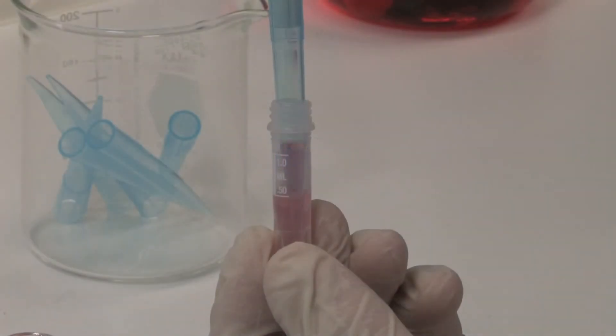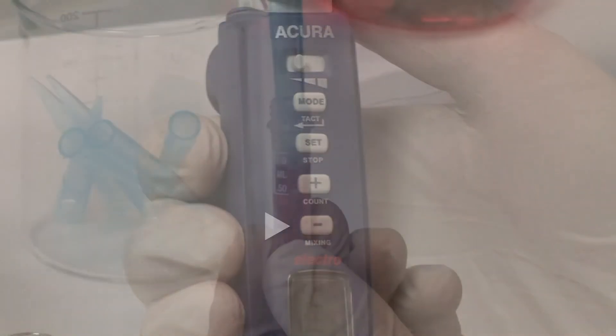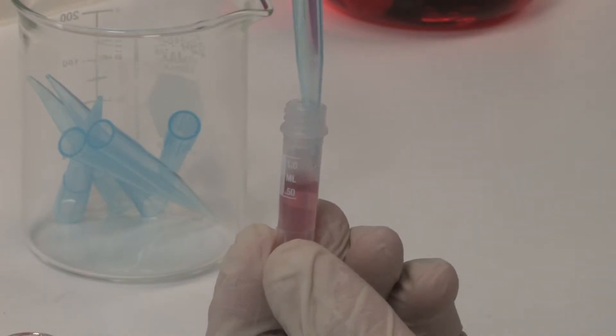Mixing creates a vortex by an up-and-down liquid flow in the tip or vial. It's activated by a simple touch of the mix key when pipetting is completed. Releasing the mix key stops the mixing action.